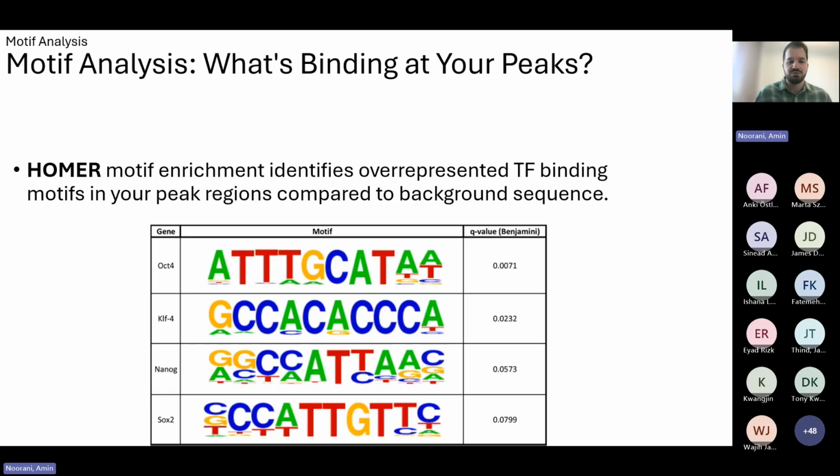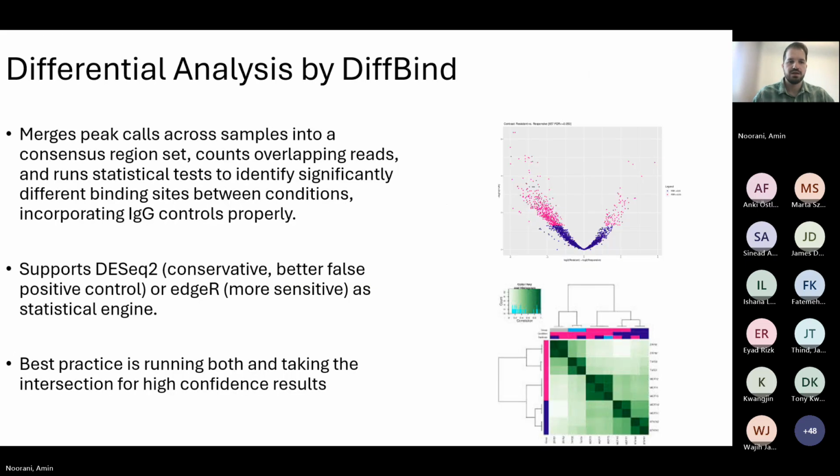So it's important to verify everything by yourself on the IGV. But this is a tool that gives you initial results. For example, if you want to test SOX2, you expect to see the SOX2 motif enriched in the peaks. So that's a kind of quality check. There are tools for TF footprinting, which are getting popular now, but they're used for ATAC-seq, like TOBIAS and ChromBPNet and stuff. But for CUT&RUN, I think up to here is enough.